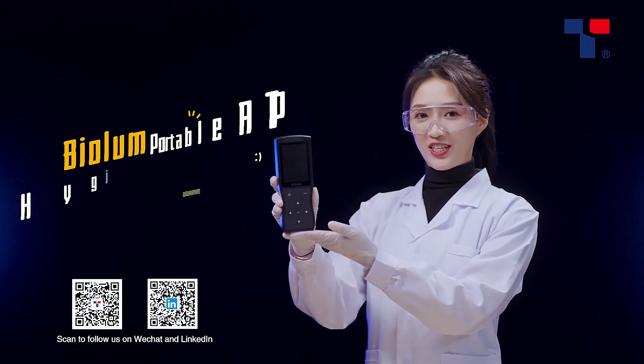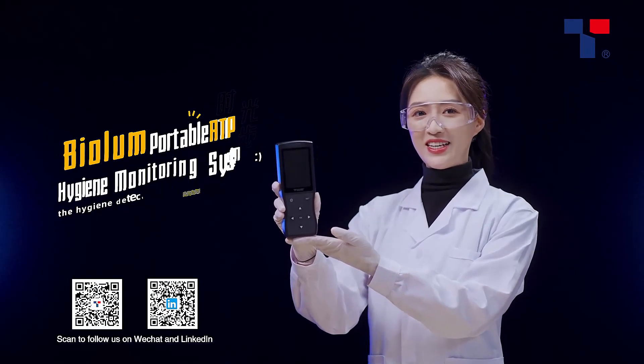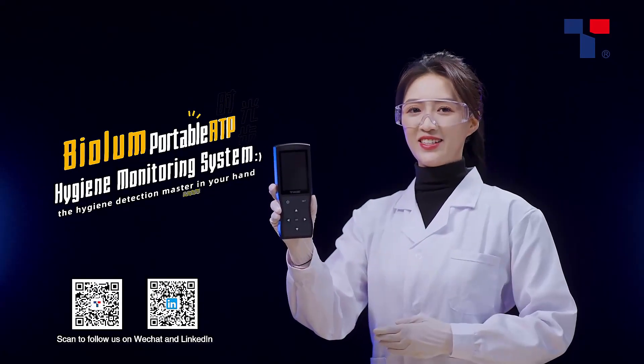BioLume Portable ATP Hygiene Monitoring System — the hygiene detection master in your hand.